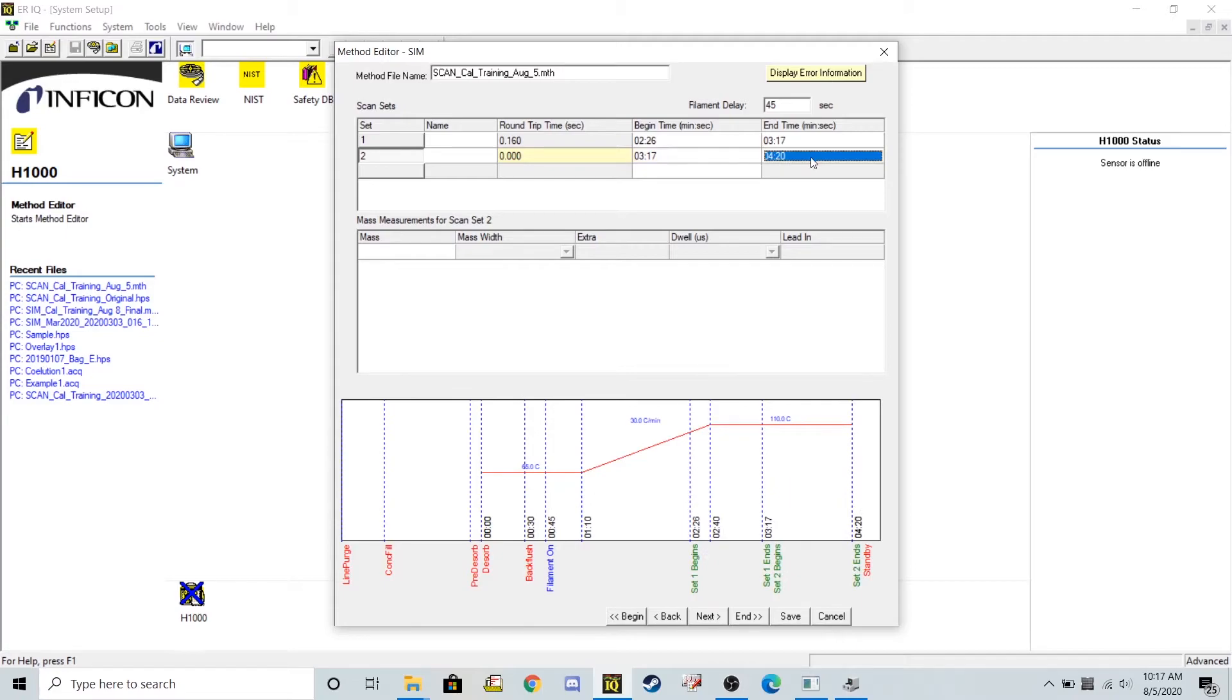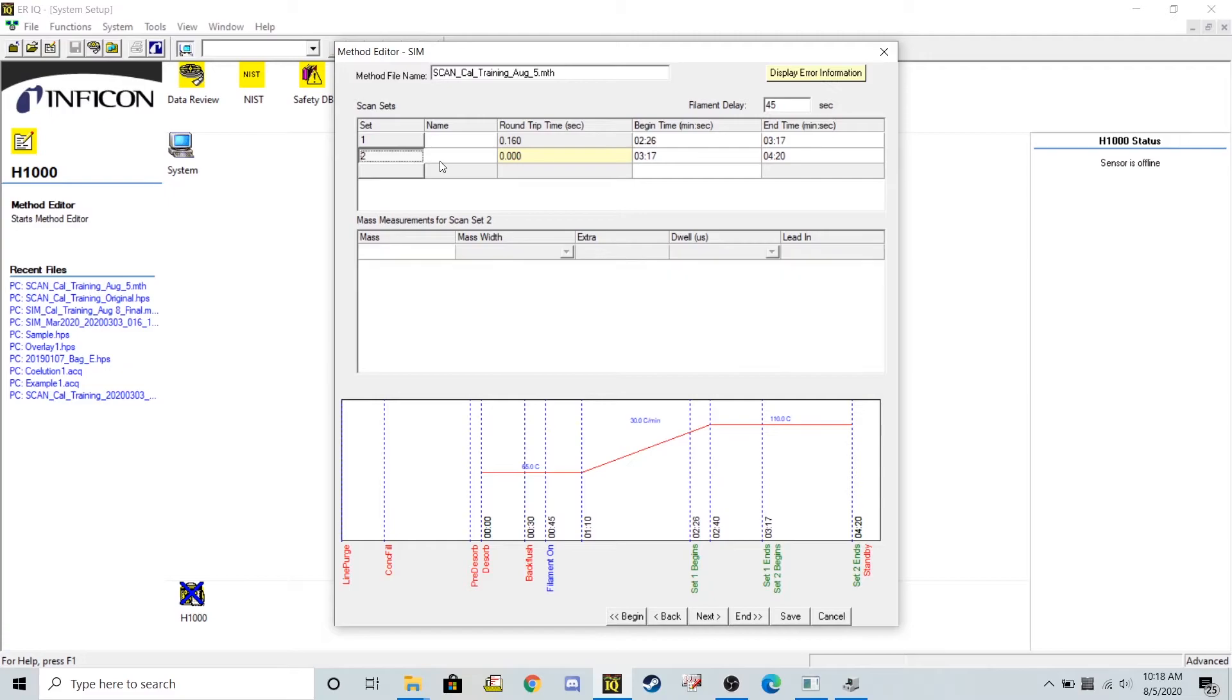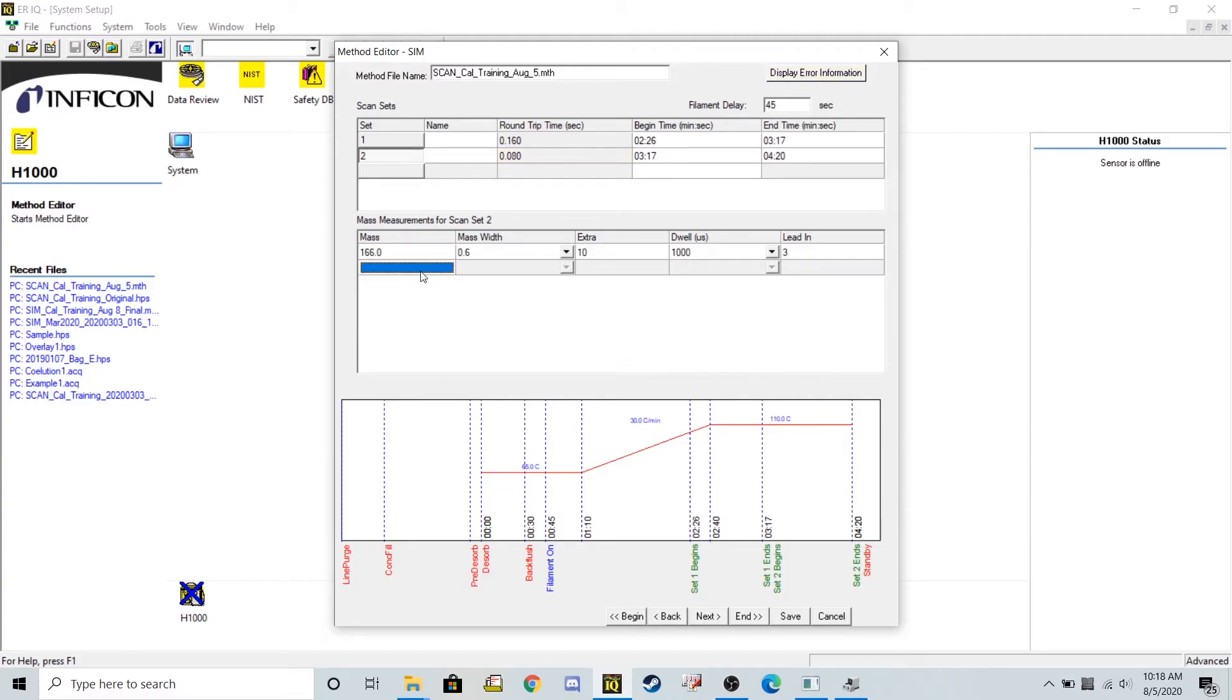These windows can be much more narrow. It really just needs to contain the chemical you're interested in. So in the second window, the ions that belong to tetrachloroethylene is 166 and 164.